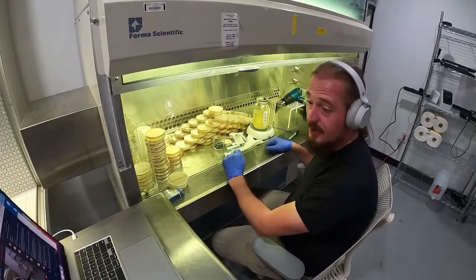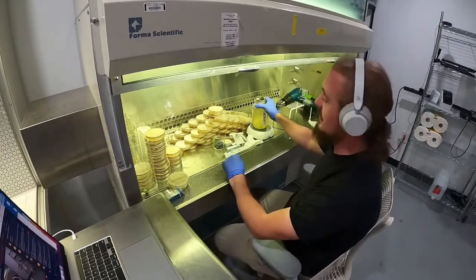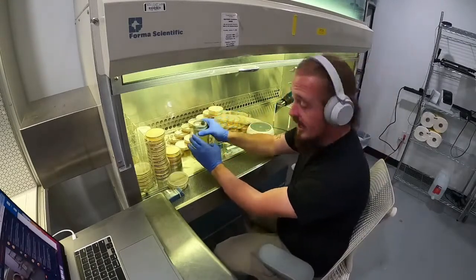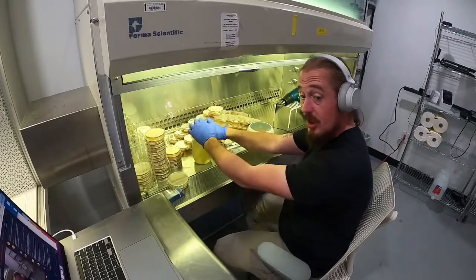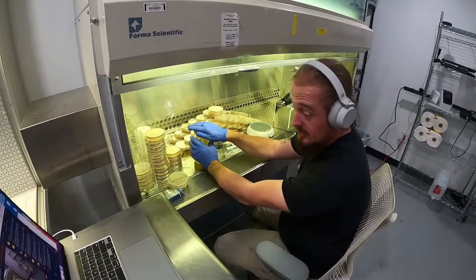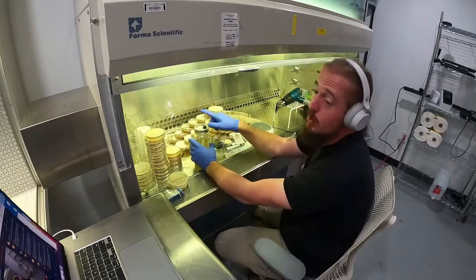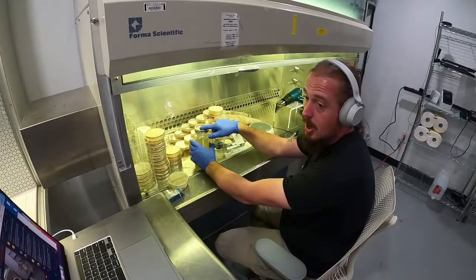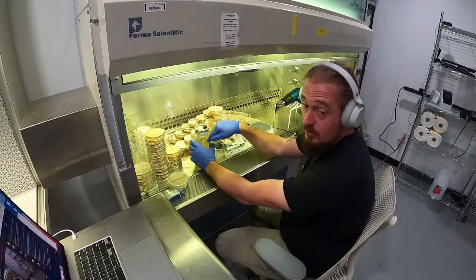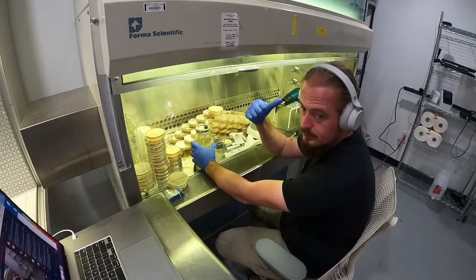How about replacing the filters on the LC lids? If this filter were to be dark or something, I'd take it right here, sterilize this, wipe it down, and then put a new filter patch on it immediately, the second I saw any type of discoloration. Otherwise, we only replace these when we wash it out. The second that filter patch gets wet, we toss it.